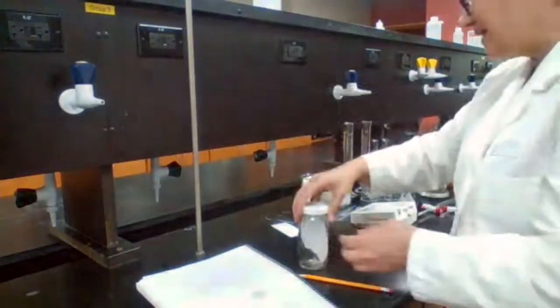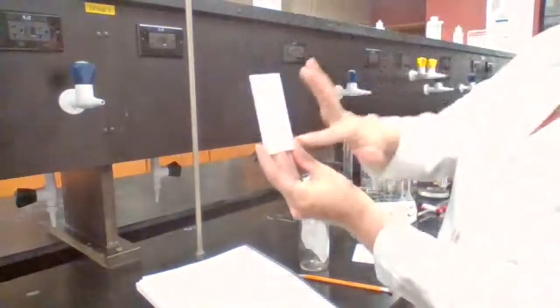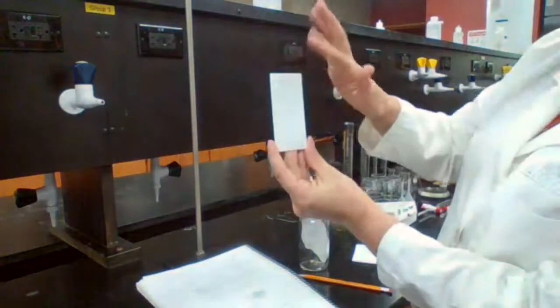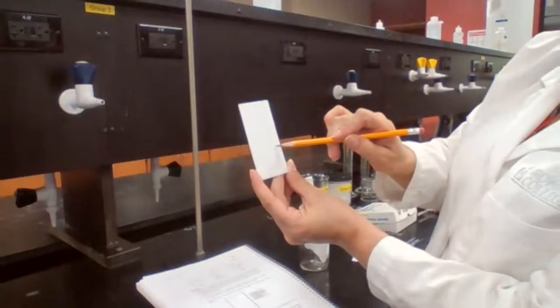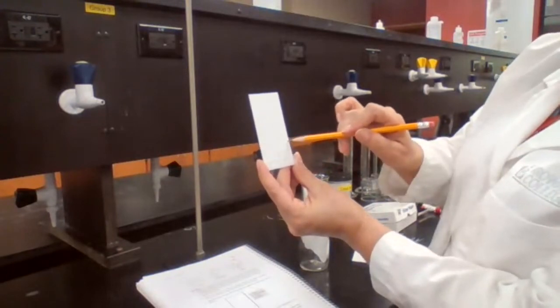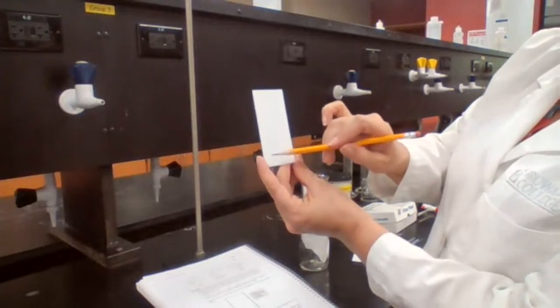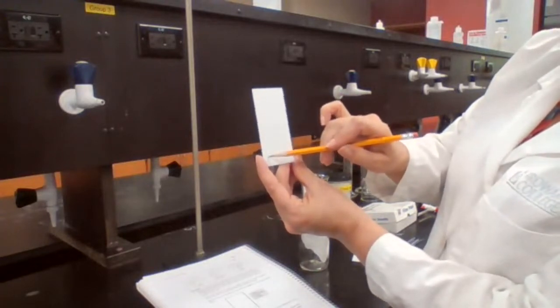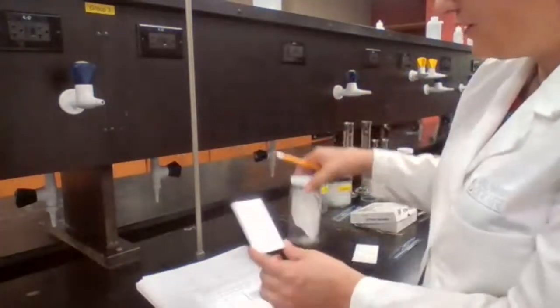The benefit of that is when I'm placing my actual plate in, the solvent is going to move in a straight line. If it's not saturated, it can move up in a curve, and then the calculation for RF is not going to be accurate, because the distance traveled by solvent is not going to be the same for all 4 samples. Does it make sense?